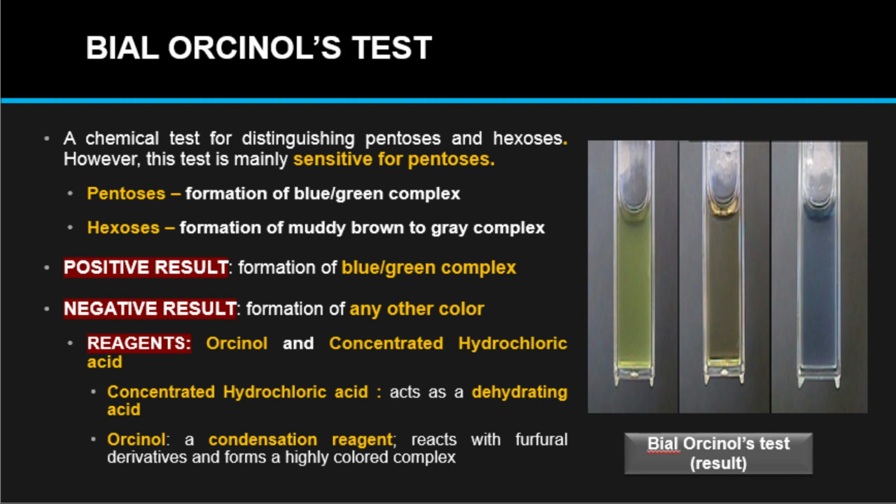Heating with strong acid converts the pentose to furfural, which then reacts with the colored compound produced when orcinol and ferric chloride react with each other. So a blue-green compound is formed. This reagent reacts with many sugars, but under the condition described, only pentoses yield blue-green colors.